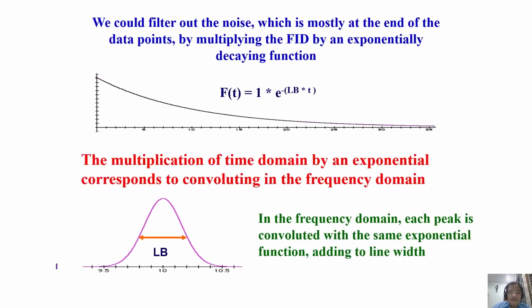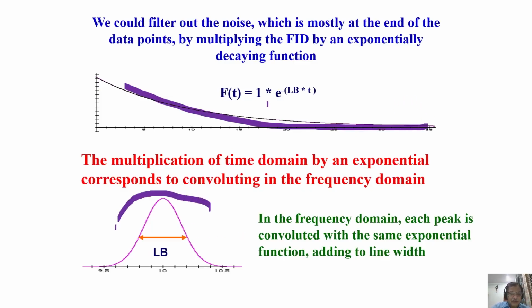While processing the data, we can play with the time domain signal in various possible ways. We can apply certain types of window functions. What are these window functions? Why is it beneficial? Let us see that now. Let us say I have a time domain signal which is decaying with an exponential like this, which you worked out. Exponentially decaying signal. I do the Fourier transformation.